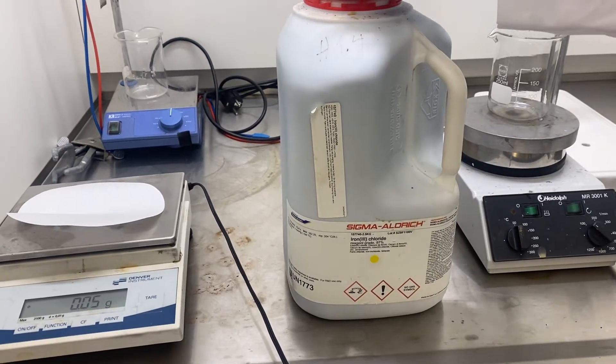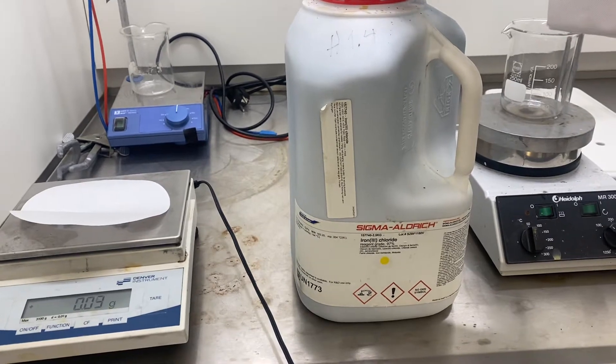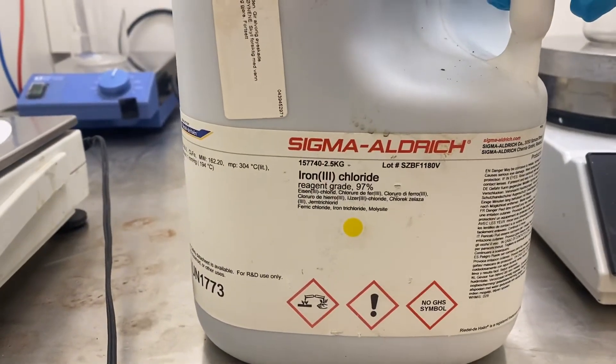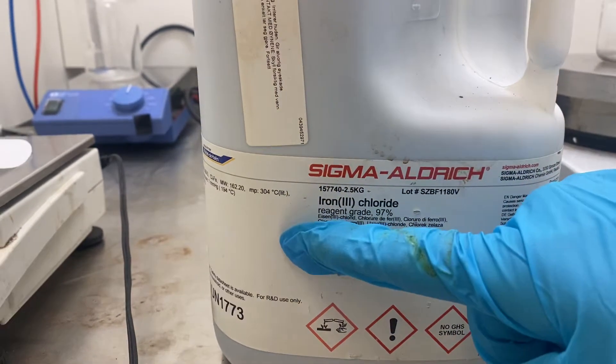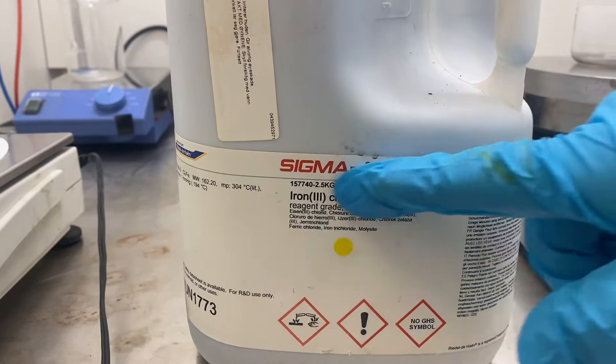In this video we're going to look at pitting corrosion on stainless steel using hot ferric chloride solution. This is the stock bottle of ferric chloride, which is a dark grey powder — iron chloride — 97% pure, made by Sigma Aldrich.